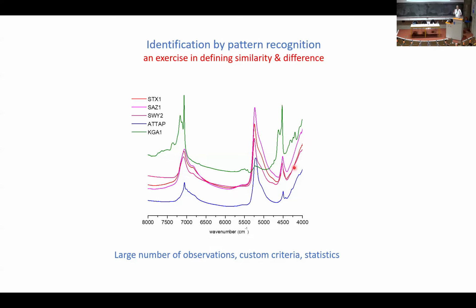So, what I'm trying to say is that each sample has a pattern, but each mineral has a group of patterns, because in terms of chemistry, more than one mineral can fall under the class of montmorillonite, but they can have different substitutions to a different level, so their spectra will be affected. So you can make a living just by analyzing similarities and differences in this type of databases. And if that's all you need, we can stop here. But there is really a lot here. Imagine, for example, starting a deposit in this manner.